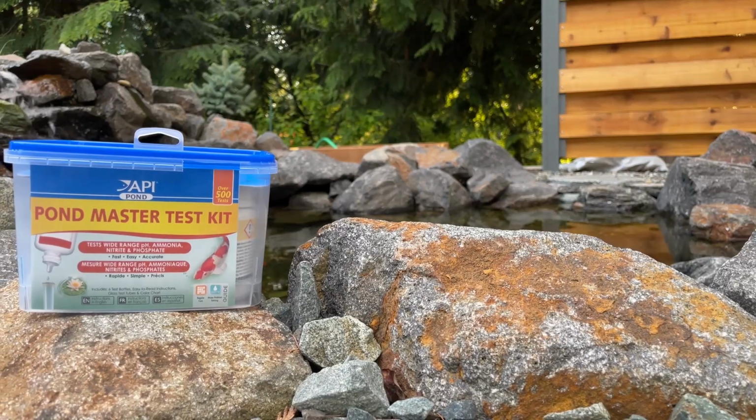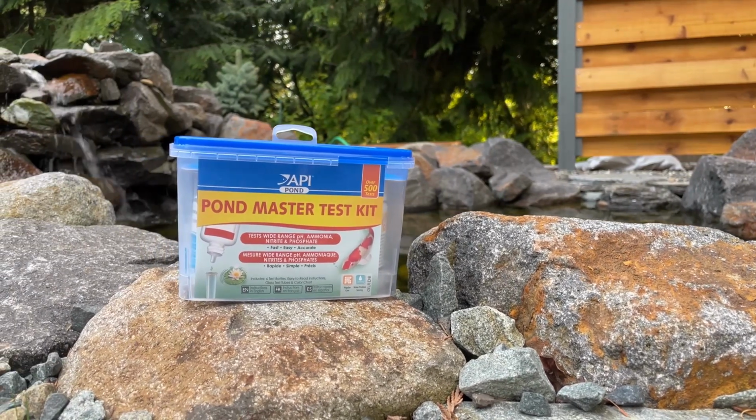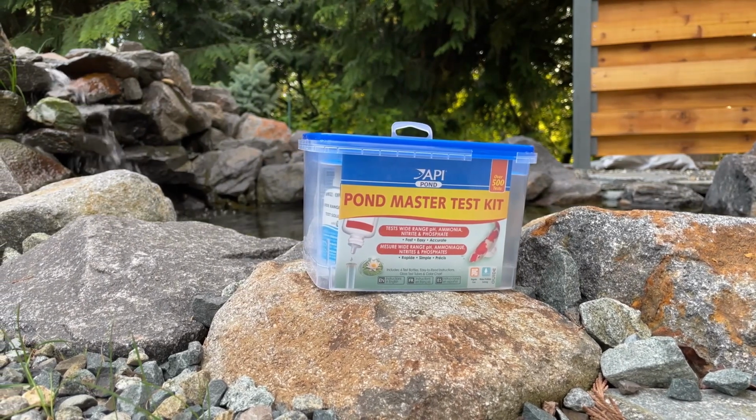Howdy everyone, this is the API 4-in-1 Pond Master Test Kit. It's pretty easy to use with results that I can only assume are accurate, but the question we're going to try and answer is, why should you buy this over easier to use strips?